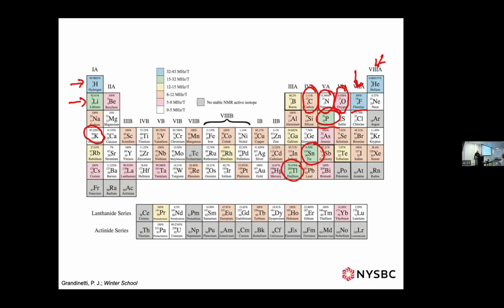Particularly if you're looking at non-spinning or static NMR spectra and looking at CSA and quadrupolar interactions, you should run DFT to start off with, so that you have some idea what the angles between the two tensors are, rather than just scattershotting trying to find them, because it's very good at finding the angles between those two interactions. It might not be very good at finding the magnitude of the CSA, but it's very good at finding the angles of those two interactions.